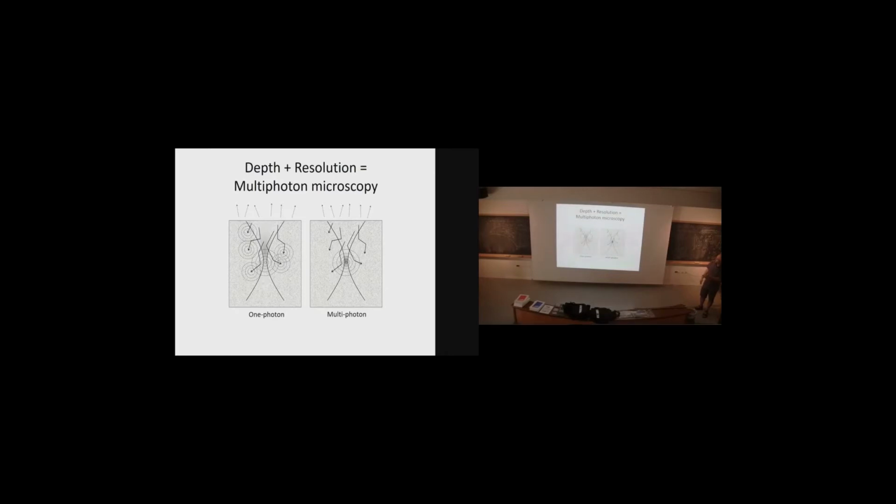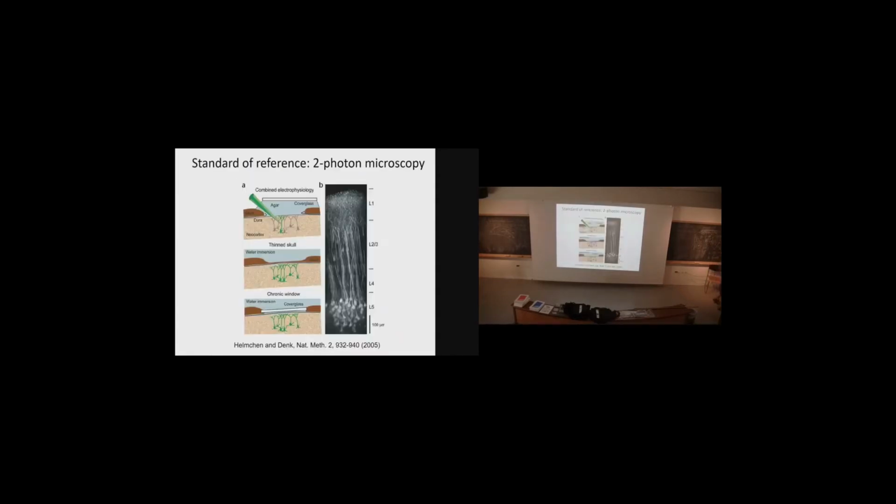And the problem with one-photon fluorescence is that scattered excitation light can generate fluorescence. On the other hand, if you use a multiphoton, nonlinear interaction, the scattered excitation does not generate background fluorescence, and the only fluorescence that you get comes from the focal spot, from the unscattered light. So that's a rule of thumb. When you use multiphoton microscopy, only ballistic, unscattered light produces signal, and you have very little background, so you have very high contrast. All right, and you get beautiful images like this. This is why it's so popular.